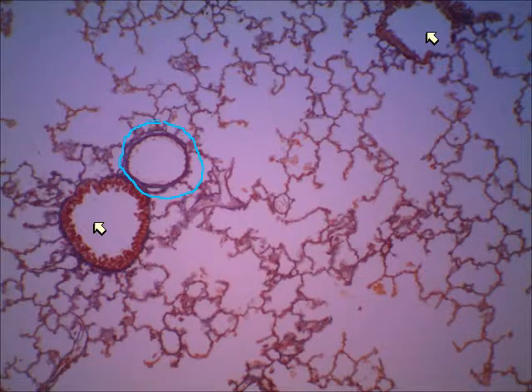All right, now I'm circling. What do you think that is? Is it an alveolus or is it a blood vessel? When it's got a real uniform-looking circle to it, that will be the blood vessel itself. The alveoli I'll circle in green. There's an alveolus. There's an alveolus. There's one. And then another, a tiny, this probably a little capillary. That's a little blood capillary. It has a much smoother appearance to it than the alveoli.